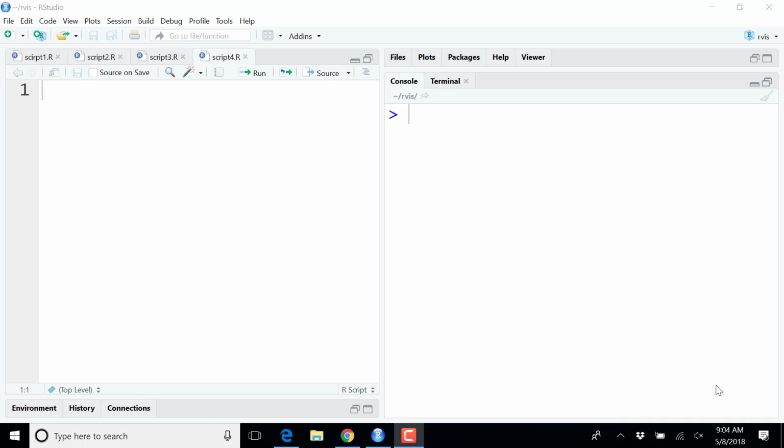Even if you don't know the values, just make them up, illustrating the perfect figure that would show the features of the data, the properties that you want to see if you have significant results, and then do the same figure, making up the data, of course, with no significant result.